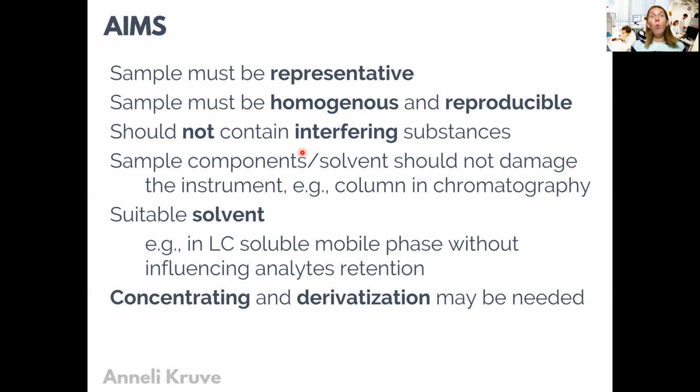Also the solvent that we are using to prepare our samples in, since mostly we operate with solutions in the measurements, is very important. So for example, if we deal with chromatography, then the solvent should not interfere with our columns anyhow. For example, we should not prepare our samples in water if we want to inject the samples to gas chromatography. Also, it's very important in mass spectrometry: not all solvents are compatible with all ionization sources.